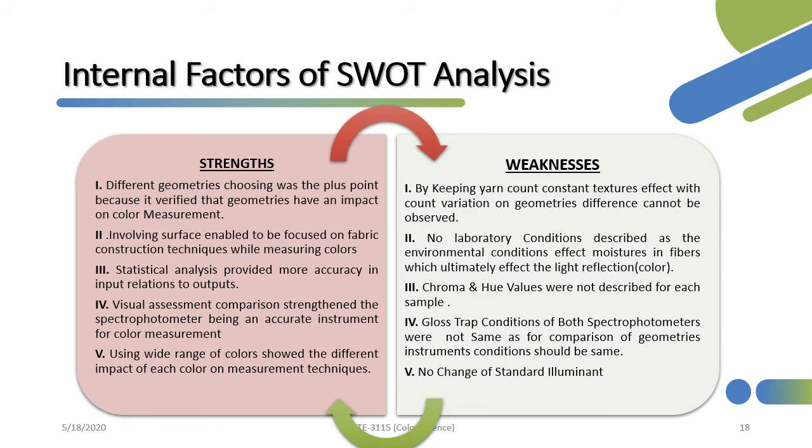And the fifth weakness was that the author used only a single standard illuminant of D65. He doesn't change any other standard illuminant in his research, and all the results were based on the same illuminant, so it might be possible that the illumination change can affect the results.